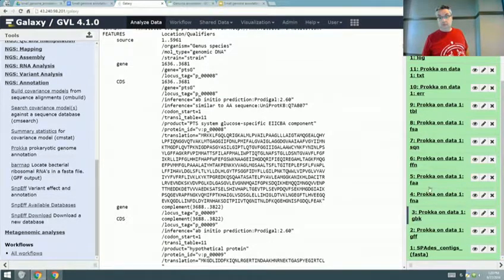And so I could put GO annotations in because I infer stuff from UniProt. UniProt has GO annotations associated with each of these. I just haven't integrated the logic into Prokka. InterPro too. I don't use InterPro. Otherwise, I'd be here all week, because running a scan against InterPro would take the whole day, half a day for bacteria. I needed something that would run on people's desktop. That was the niche. They really needed something they could do on the desktop. But you're right, I could make Prokka 2 on the cards. Always version 2.